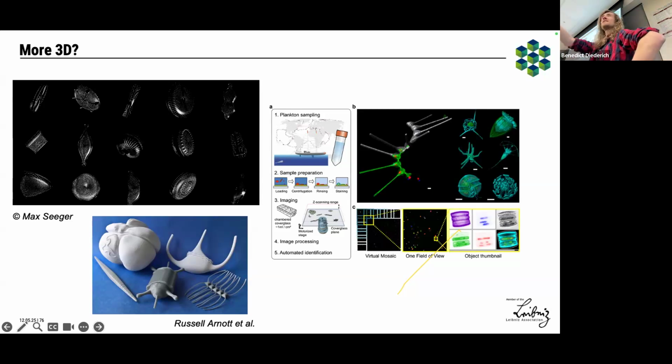So you want to have a section of optical paths of your volume, especially in biology nowadays. Many people work with organoids, big assemblies of cells, and you only want to slice a certain piece of it because it's a very turbid medium. The way you could do it is, let's assume this room is dark, and I just illuminate from the side, maybe with a projector, the first row, then the second row, and then the third. And this is literally the idea of light sheet.